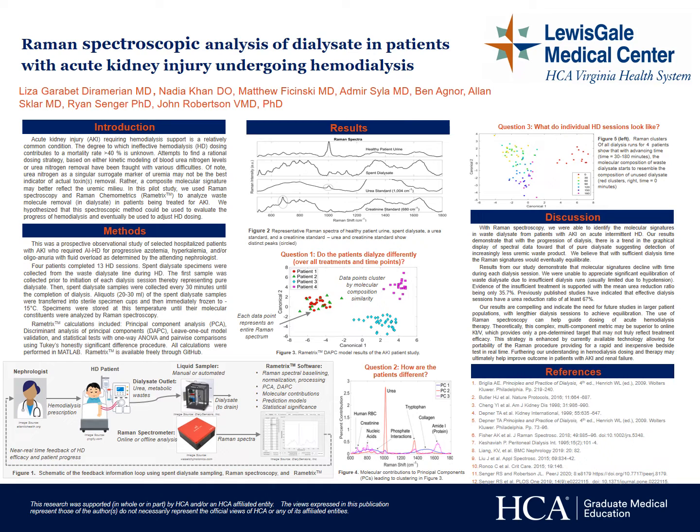Also, we conclude that the molecular composition of waste dialysate differs amongst patients with acute kidney injury, as well as from treatment to treatment in the same patient, suggesting the need for customization of dialysis. Finally, this spectral technique can be run rapidly and inexpensively at the bedside in real time, allowing for immediate adjustment of dialysis time.